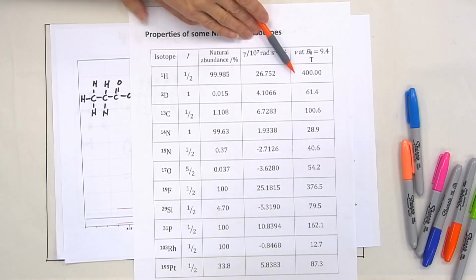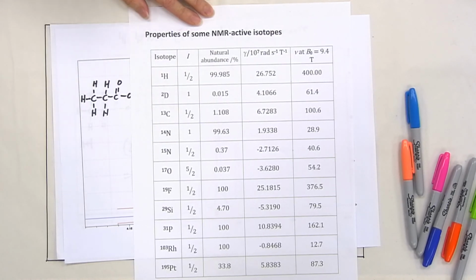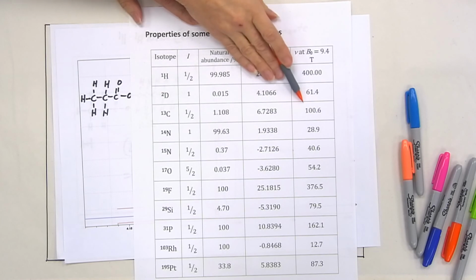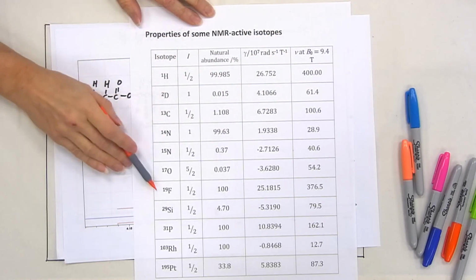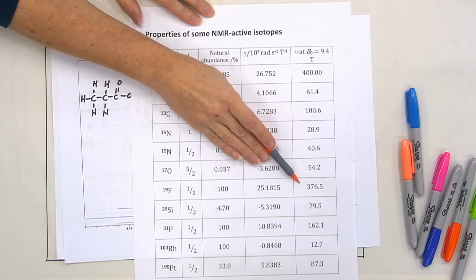In this case what we would do is just tune the spectrometer to a different resonance frequency. So for carbon-13, you'd use the same spectrometer, but here you would be looking around 100 megahertz. Other common nuclei, and one that we'll consider later on, is fluorine-19, which would resonate at about 376.5 megahertz.